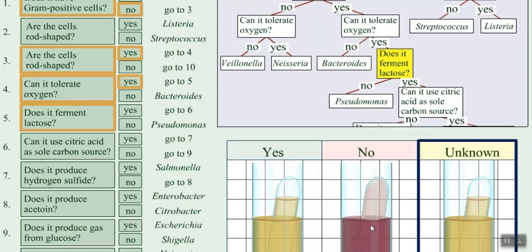Once you inoculate them, if they can break down or utilize or ferment lactose, they can use that for an energy source, and they're going to produce acids as a byproduct. It's those acids that will trigger the pH indicator in the dye and turn that very pretty pink or reddish color a nice yellow. So the drop in the pH, because acids have a lower pH, a pH of 6 and below, turns the indicator dye yellow. So letter D is your best response for that one.